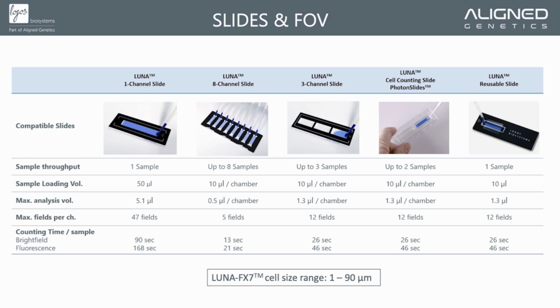So if you want to focus on one sample, the one-channel slide is your option. The 8-channel slide can hold up to 8 samples, while 3-channel and 2-channel slides can hold up to 3 and 2 samples, respectively.